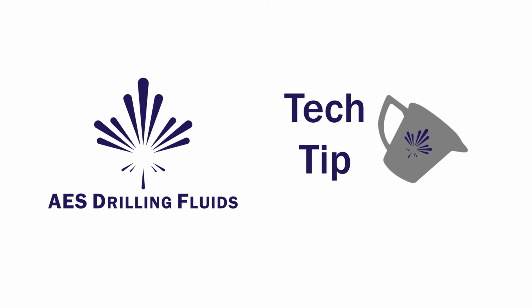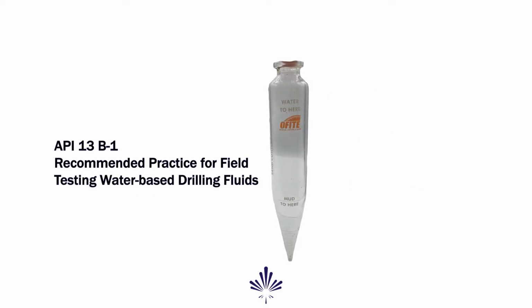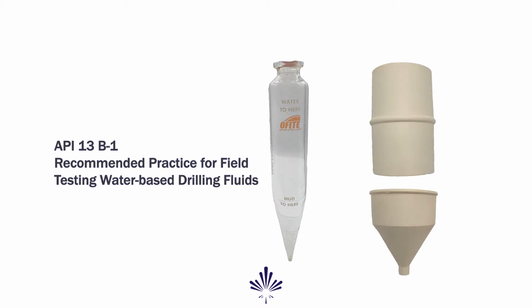We're going to address basic drilling fluids concepts in hopes that we can tackle far more complex problems in the future. In this tech tip, we'll go over the sand content test. While quick and straightforward, the sand content test is an important part of any water-based mud check.